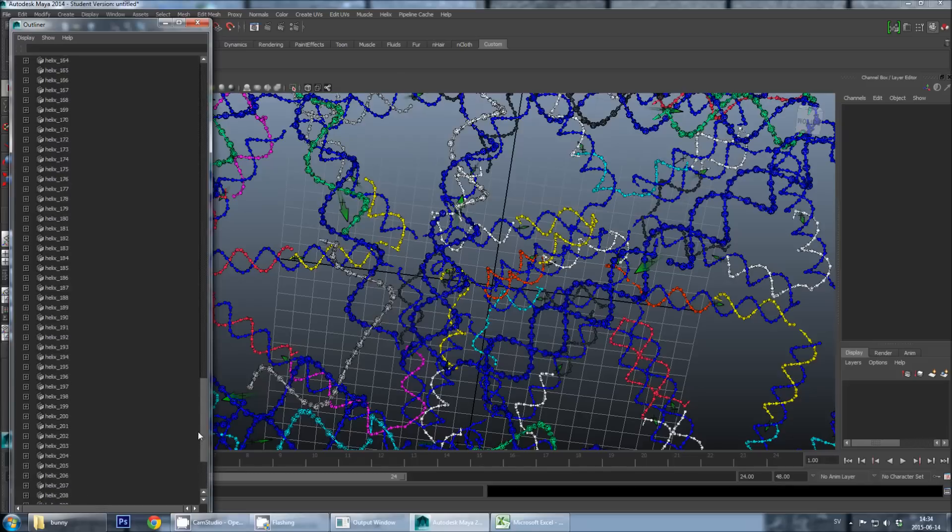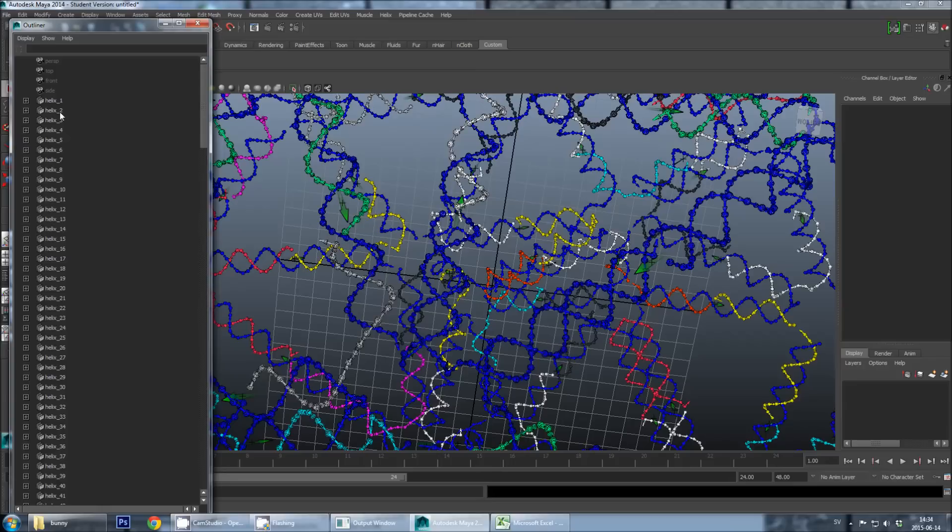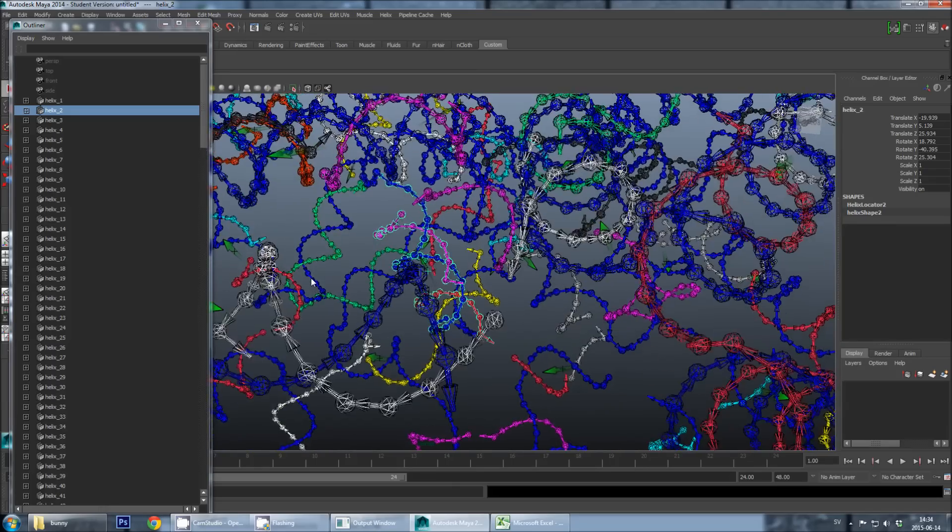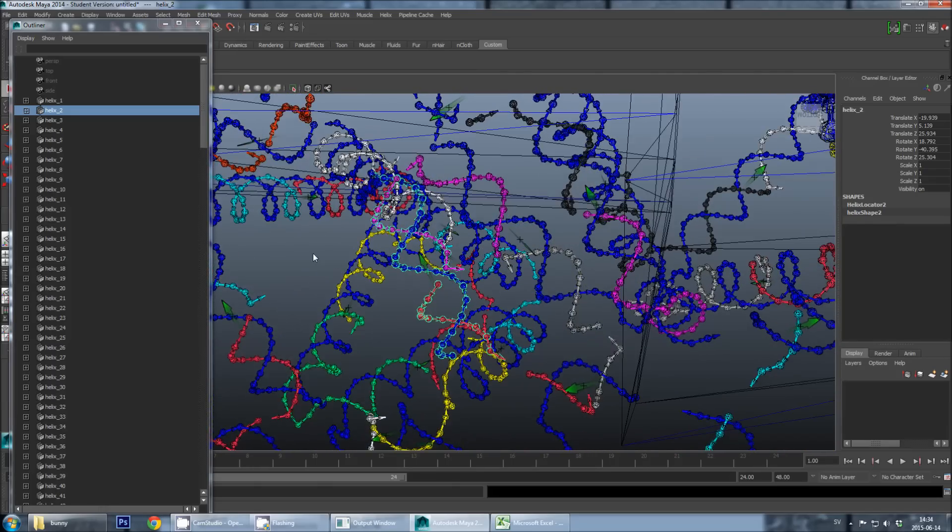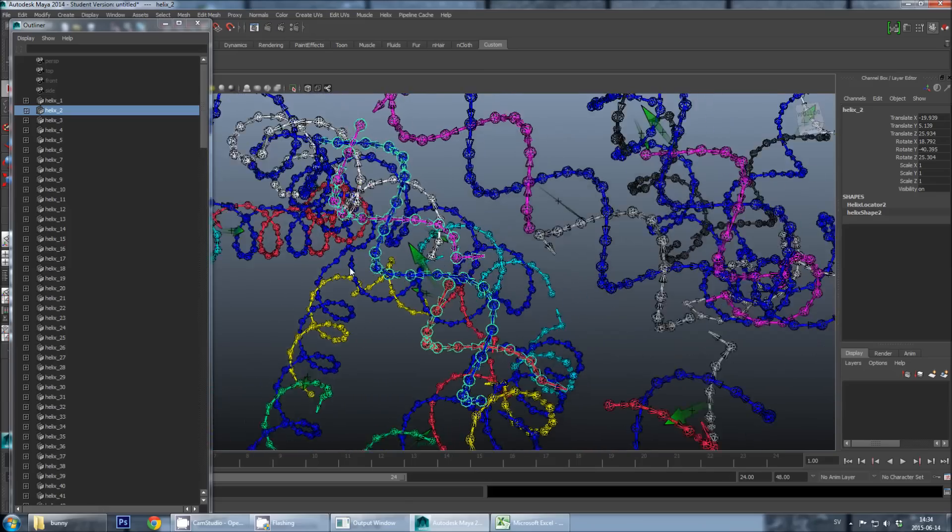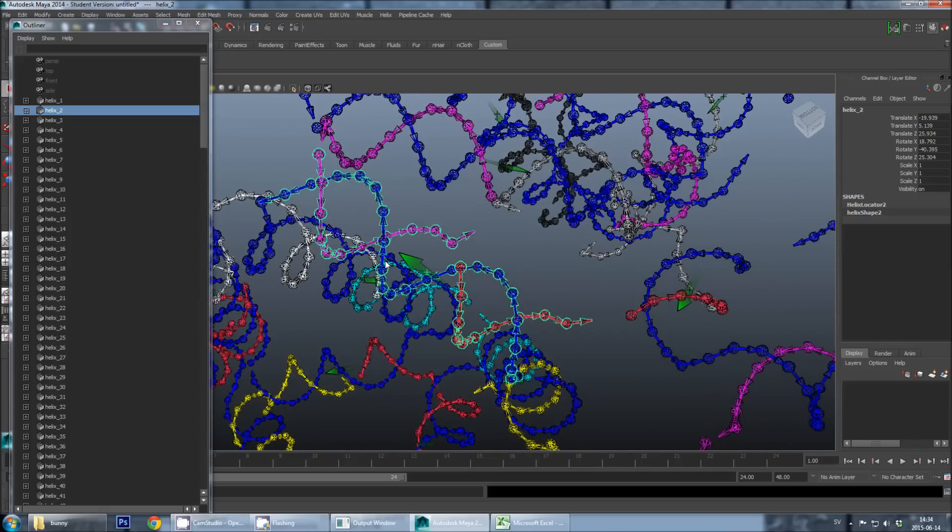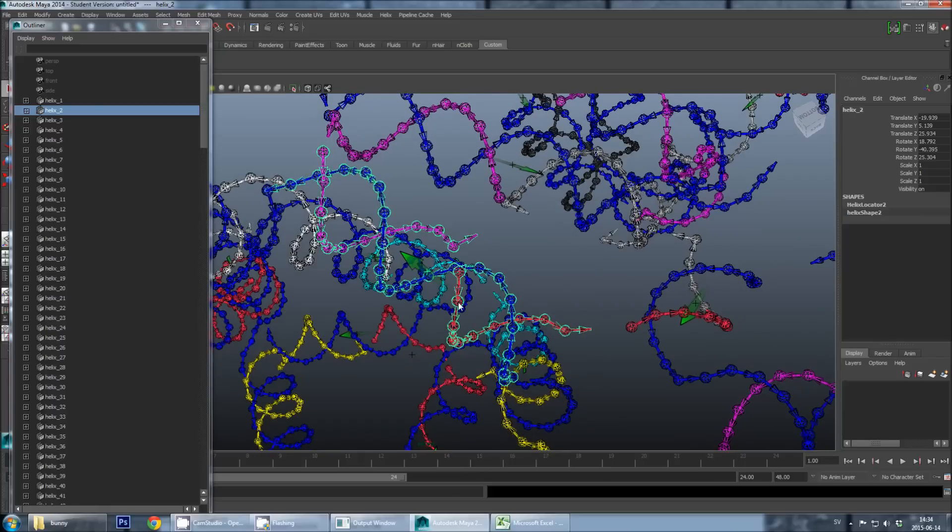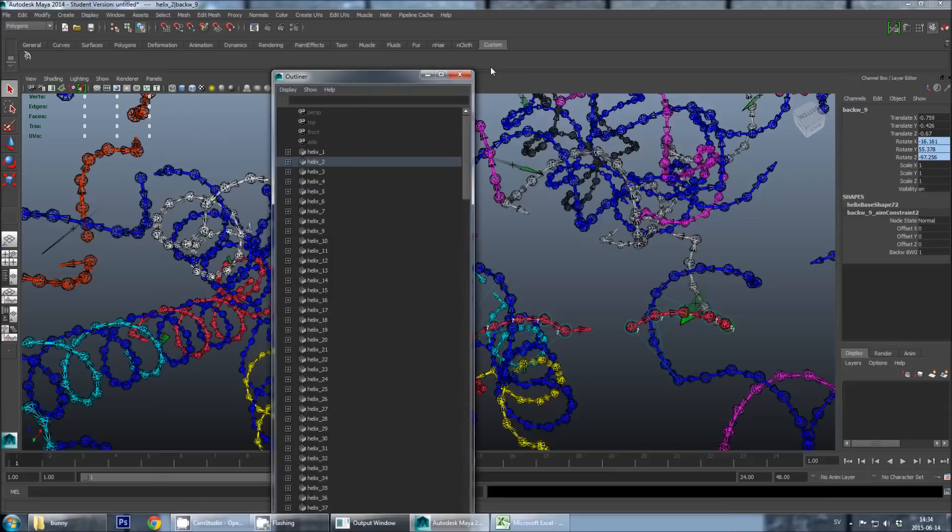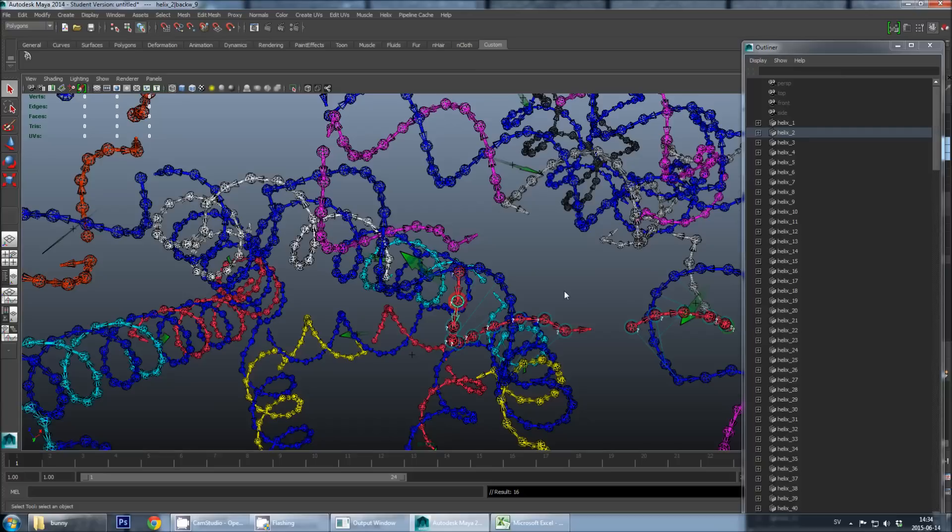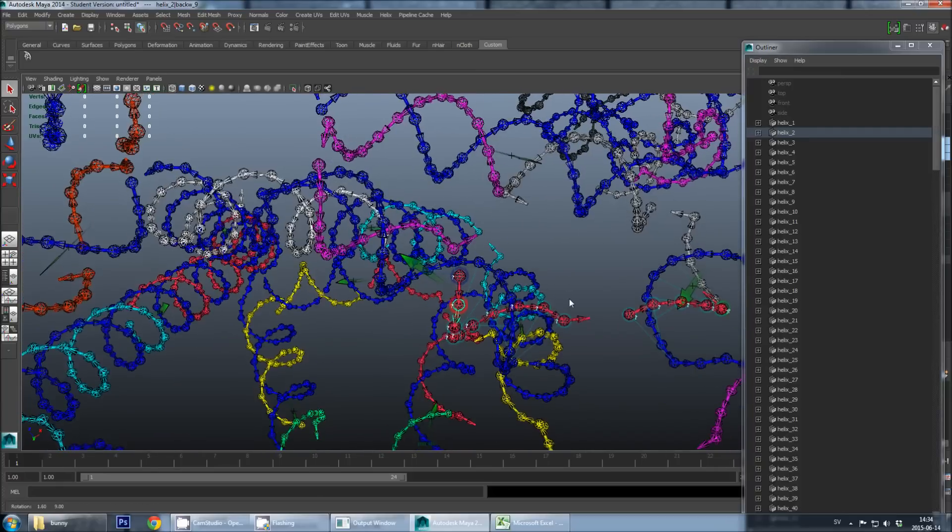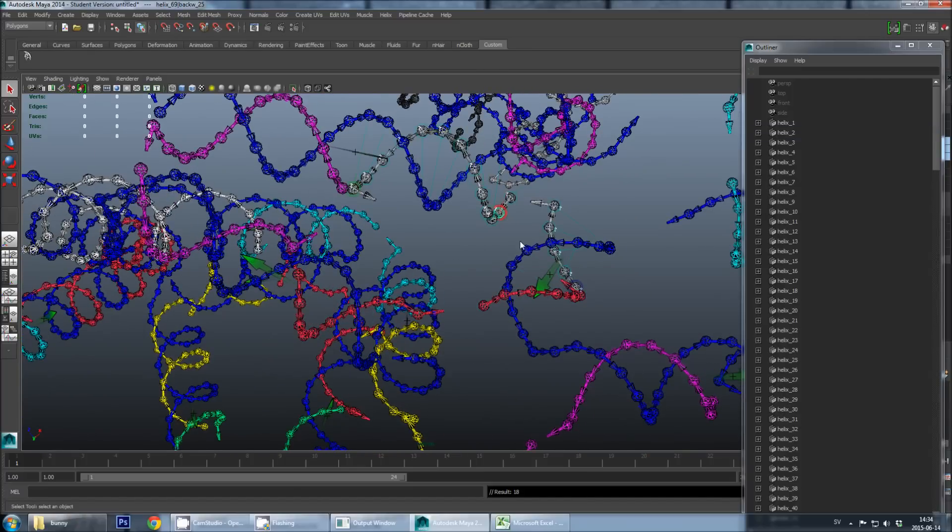So this staple was connecting from Helix 2, so then I select Helix 2, and I press F to move to that strand. And then I can see that it's probably this red strand that is very short. So I select it, and then I hit my special button here, and see that that is the 16 base strand.